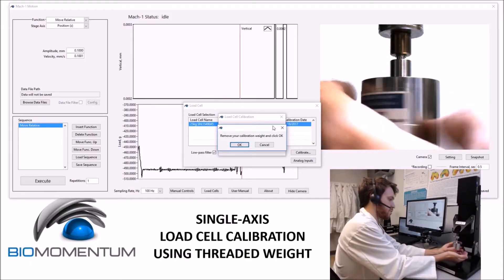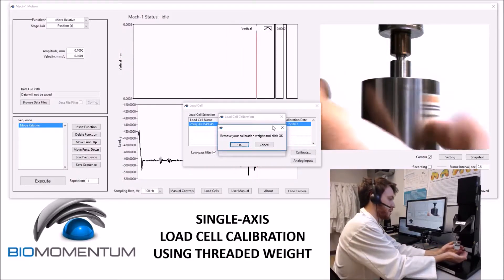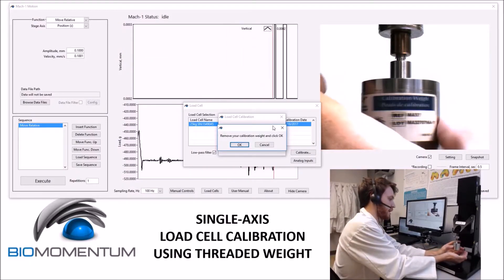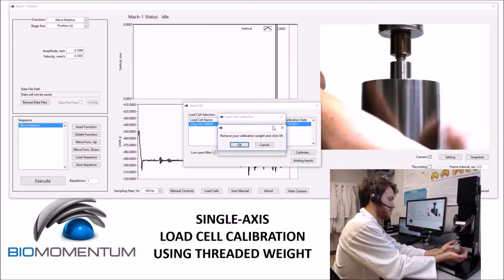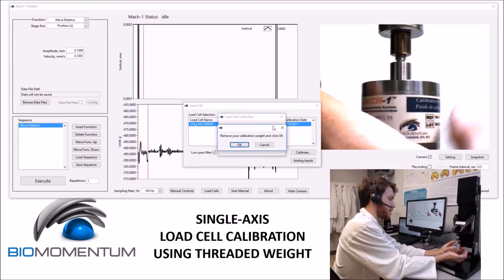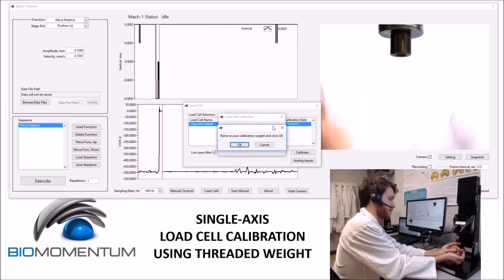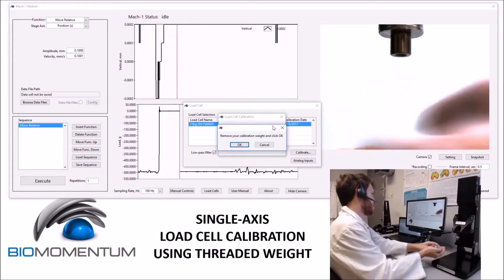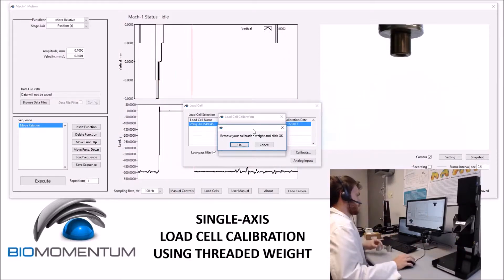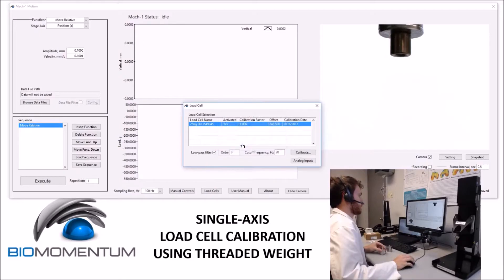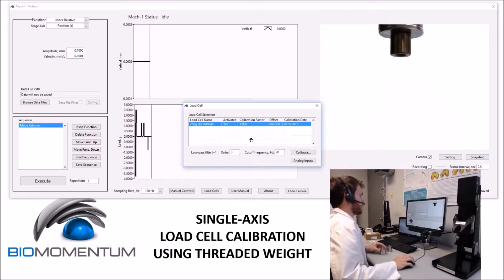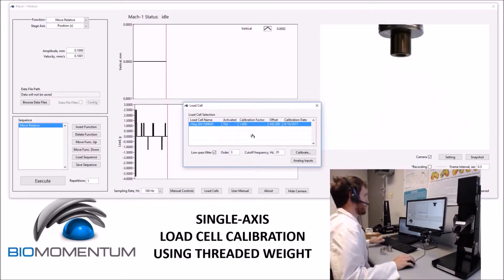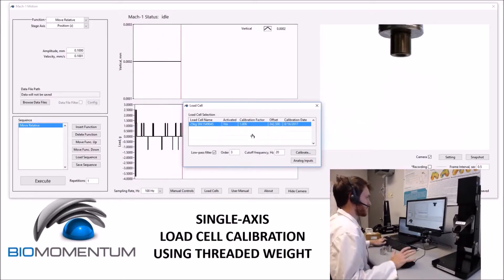To remove the calibration weight, I usually keep one hand at a distance from the weight and then let it drop into that hand. The load cell is now calibrated.